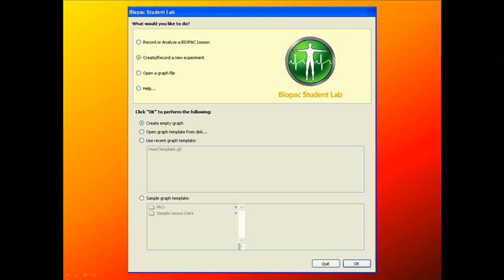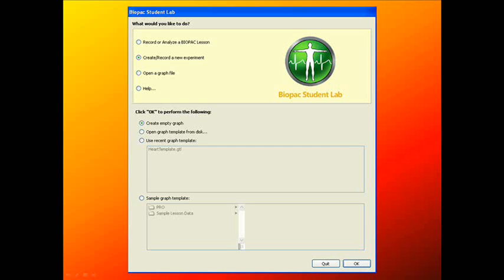Okay, first, how to launch the Biopac Student Lab software in the correct mode to create our own lesson. After launching the BSL-4 icon from your desktop or program file, you'll be prompted with a pop-up menu that looks like this. From here, what you're going to do is select the radio button next to Create slash Record a New Experiment.